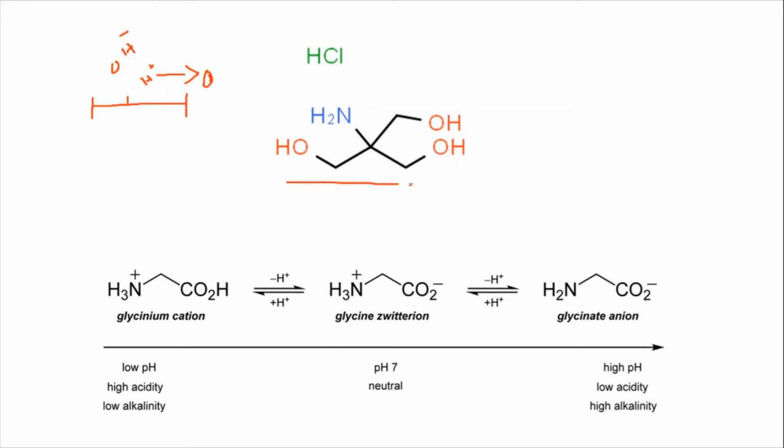Followed by this hydrolysis, we are supplying Tris-HCl as a part of the running buffer. This Tris-HCl gets dissolved in the water. It produces Tris, hydrogen and chloride ions. This chloride ion is called the leading ion. You know very well, chloride is highly negative, so it can migrate very fast to the anode.